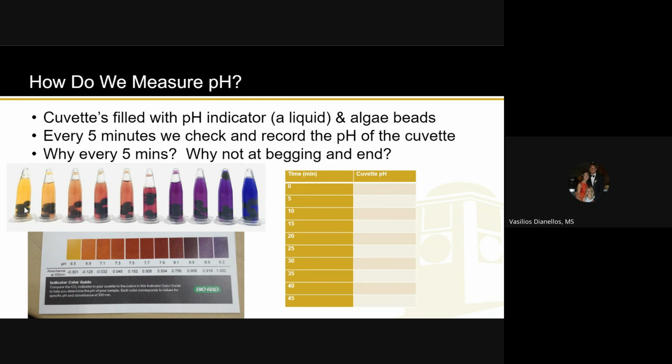First of all, if you only had one algae bead, like say, in this tube, and you put it under light and it didn't photosynthesize, you might think, oh, there must have been something about that condition. Maybe it wasn't close enough to the light, right? But in all actuality, you might have a dead algae bead, right? So you might think it didn't photosynthesize because the light wasn't enough, or the temperature was too cold, or it was the wrong color light, or whichever experiment you're doing. But in all actuality, it may be because you just had a dead algae bead.